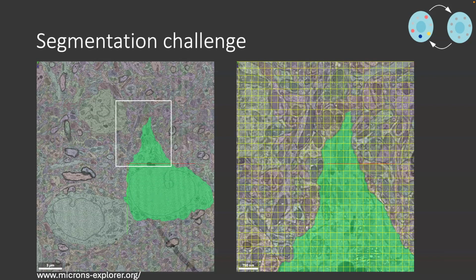And if we now overlay that with the highest resolution we get in regular wide field microscopy, you see that many of these features are smaller than the pixel size. So it's a fundamentally hard problem to perform proper cell segmentation. What many people do, of course, is that they only focus on the cell body as a workaround. But just to say that it's hard and it will stay hard, this problem.